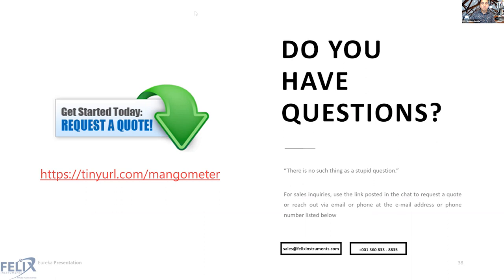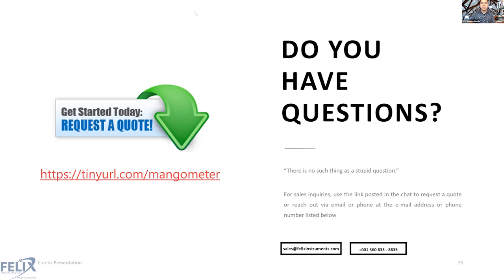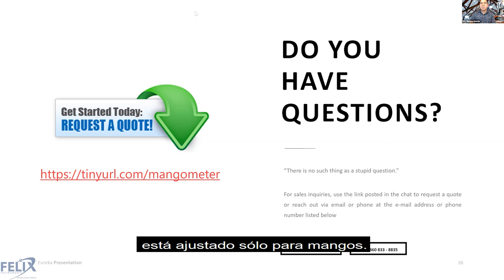Carlos is asking, is it applicable in other fruits? The F750 produce quality meter is. We have a link in the chat to the other commodities that can be used. For the F751 mango quality meter, it can't be. It's only tailored to mangoes.